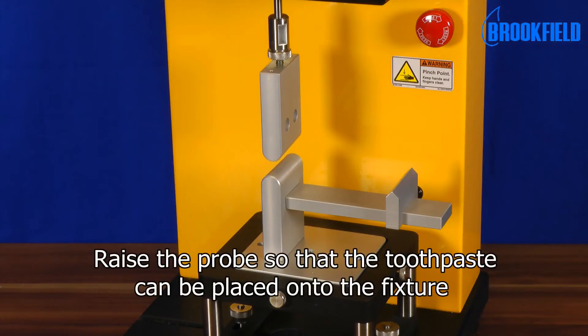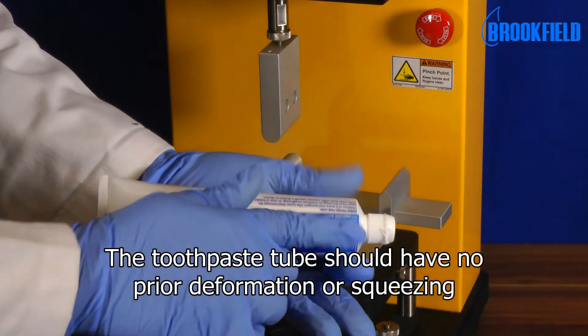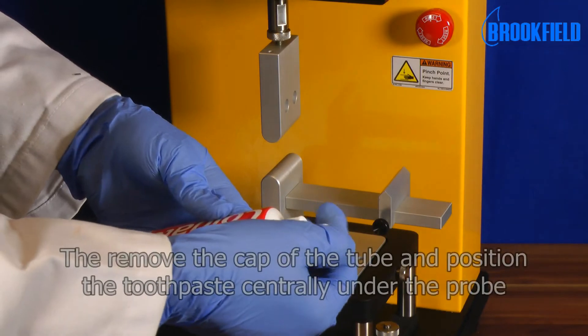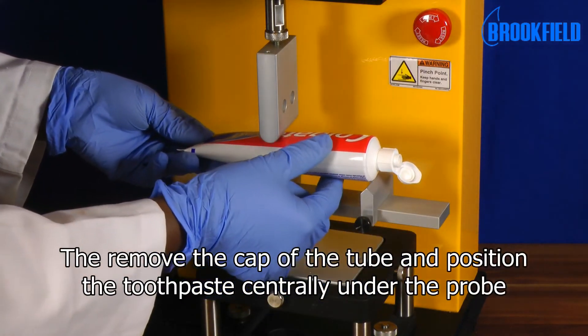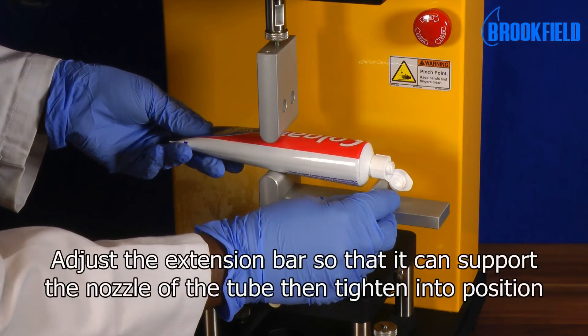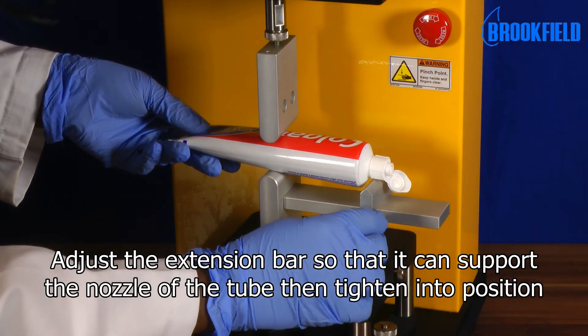Raise the probe so that the toothpaste can be placed onto the fixture. The toothpaste tube should have no prior deformation or squeezing. Remove the cap of the tube and position the toothpaste centrally under the probe. Adjust the extension bar so that it can support the nozzle of the tube, then tighten into position.